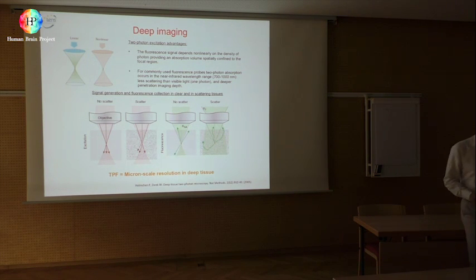Of course, something that you cannot neglect is the emission. In this case, if you have scattering from the objective, the emission is not seen anymore like a single point emitter. So the wavefront here is distorted, and then you lose photons because they fall outside of the area of detection.